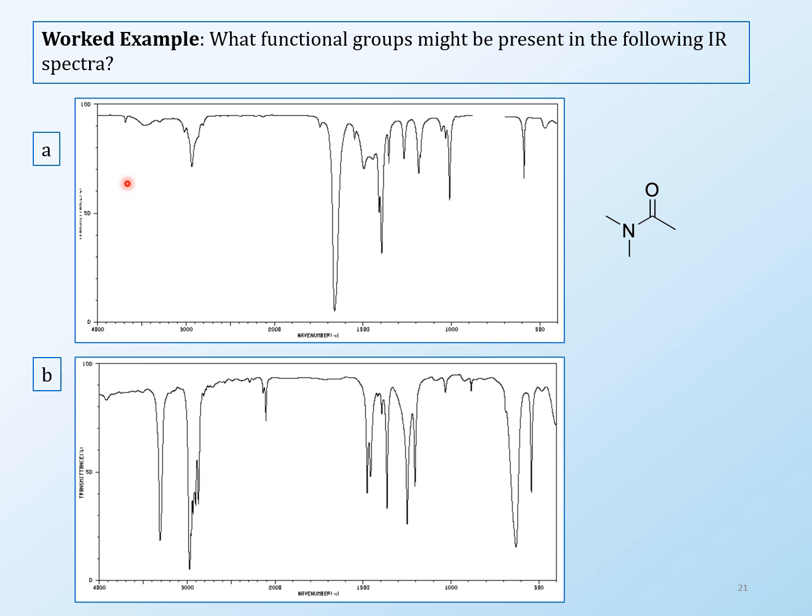Okay, let's look at this one here. Now, what is this? I know what this is, right? This is an alkyne or nitrile. But because I'm seeing this long peak over here, this is going to be this very sharp, nice peak for a triple bond carbon-hydrogen. And then this is a triple bond over here. So I think this is an alkyne, and I am right. So focus on the things that you want to see and just go from there. Nothing much more to it.